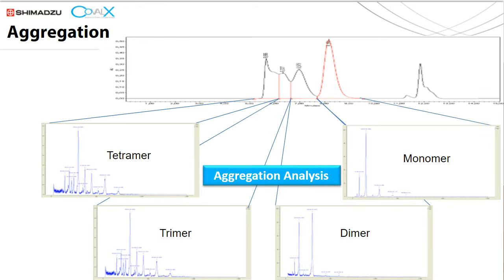Aggregation is an issue that many of our clients experience when developing biotherapeutic protein drugs. This can be not just for antibodies, although it's definitely an issue for antibodies, and that's what's shown in this example. But for any protein biotherapeutic, aggregation can be a concern. Historically, it's something that's measured later in the development stage, but it is something that's been pushed sooner and sooner to select out for developability. And so having a more rapid and direct measurement of characterization is crucial.